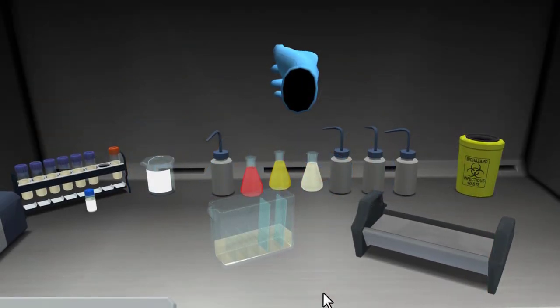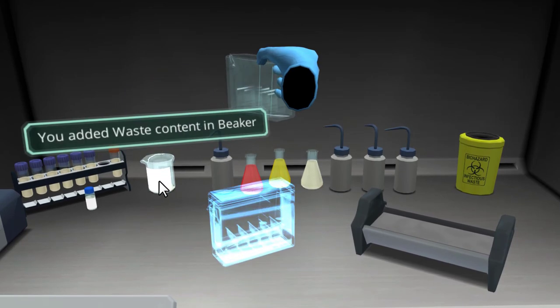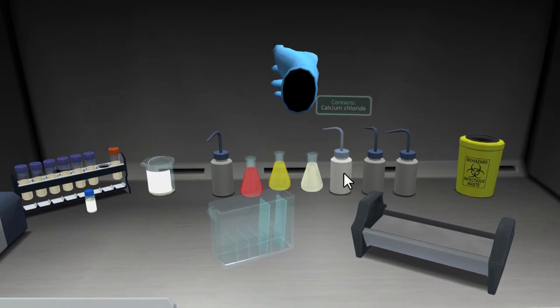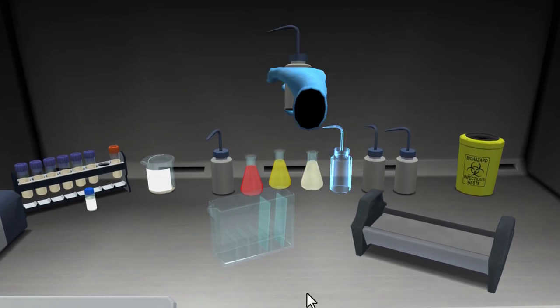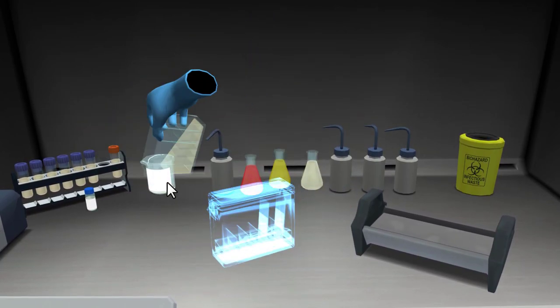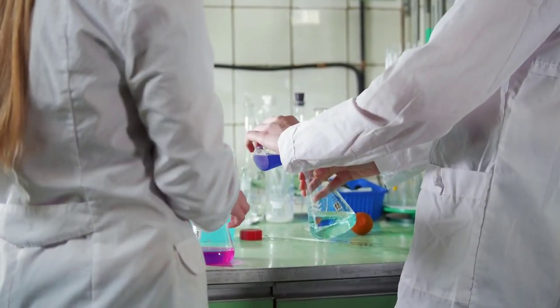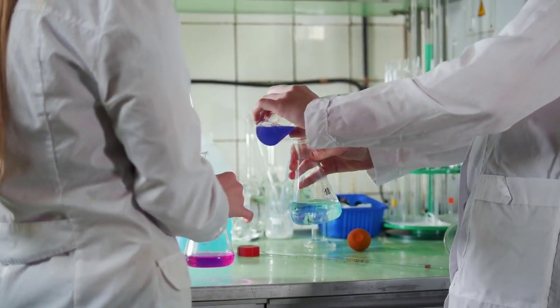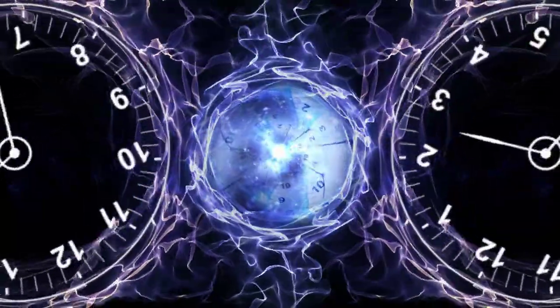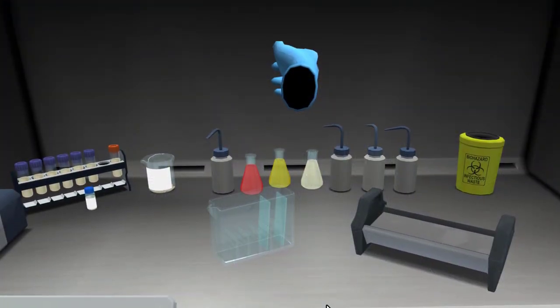Wait for 25 short minutes. Pour the staining dish solution out into the beaker. Put the staining dish back onto the workbench. Wash the slides with calcium chloride and then pour it into the beaker when you are done. I've done the last two washes for you. Now that the sample has been cleared of the ATP solution, we can add cobalt chloride. It needs to incubate for 10 minutes in order to produce a good dark color that we can see using a light microscope. Add cobalt chloride to the slides in the staining dish.